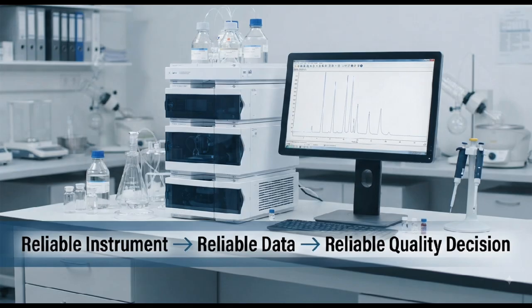Most importantly, never assume that one calibration procedure or acceptance criteria applies to every HPLC. Always follow the specific approved SOP, manufacturer requirements, and applicable regulatory or pharmacopoeial requirements. Remember, reliable instrument performance supports reliable analytical data, and reliable analytical data supports reliable pharmaceutical quality decisions.